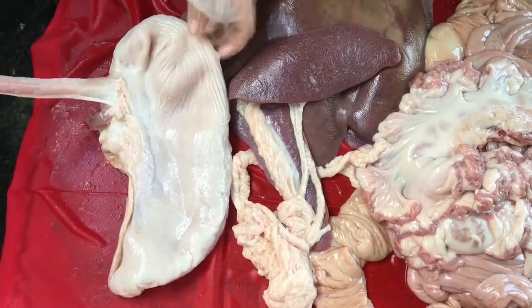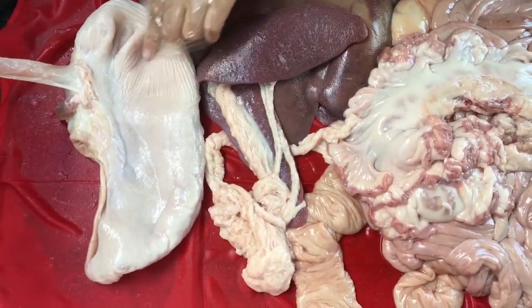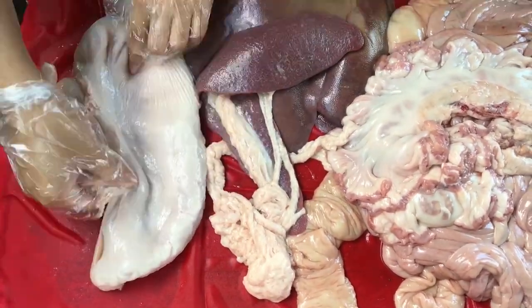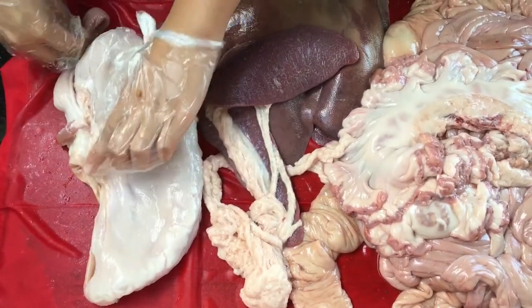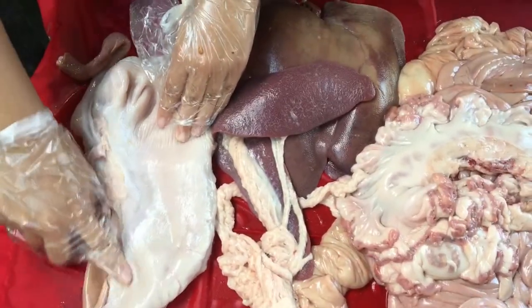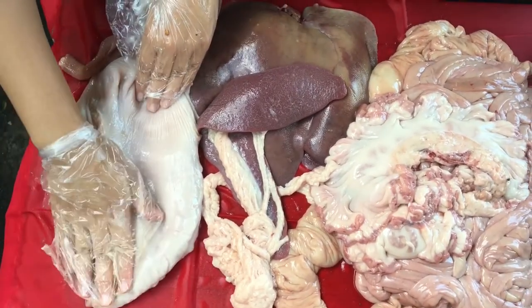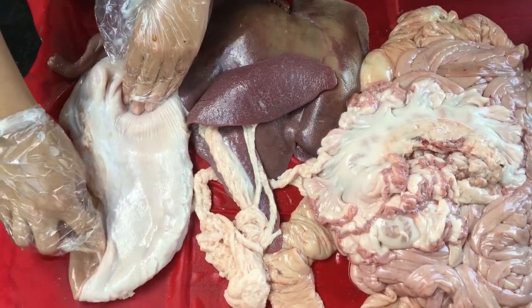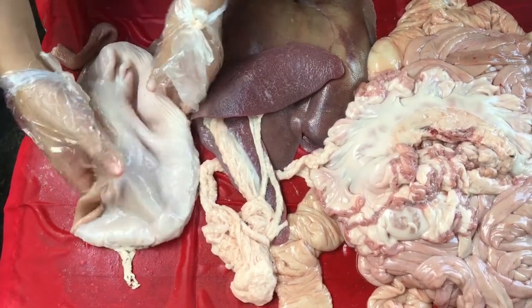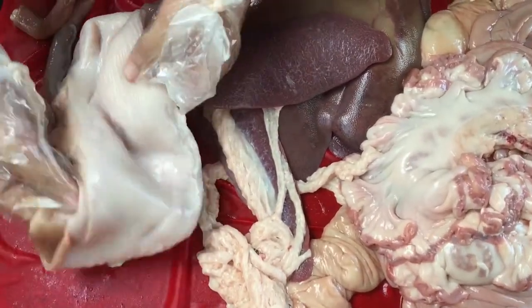So here is the esophagus and the esophageal sphincter, and the rough area here is the rugae, and the pyloric sphincter. The pyloric sphincter is what prevents food from moving out of the stomach and into the small intestine. That sphincter is often closed, so the food material coming in will stay here for digestive enzymes and so on. The stomach facilitates digestion, and the sphincter will relax and allow food to move out into the small intestine.